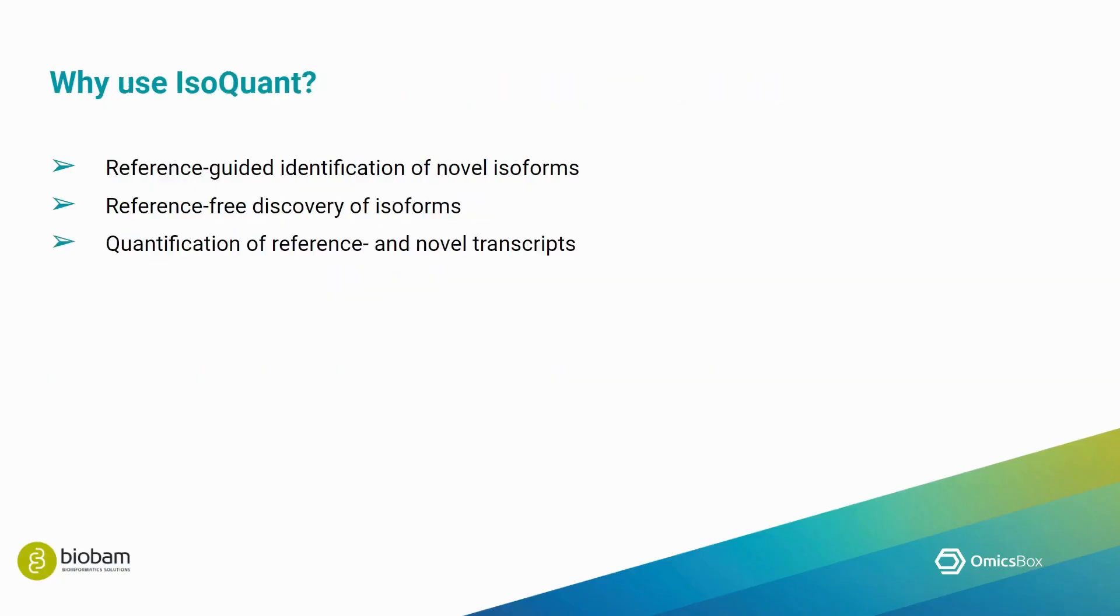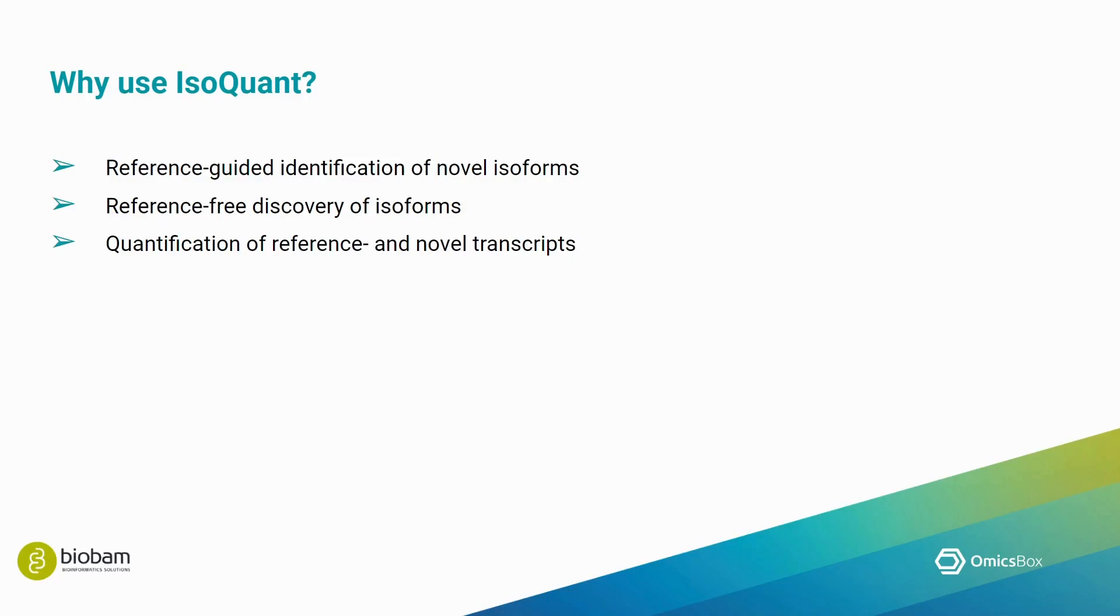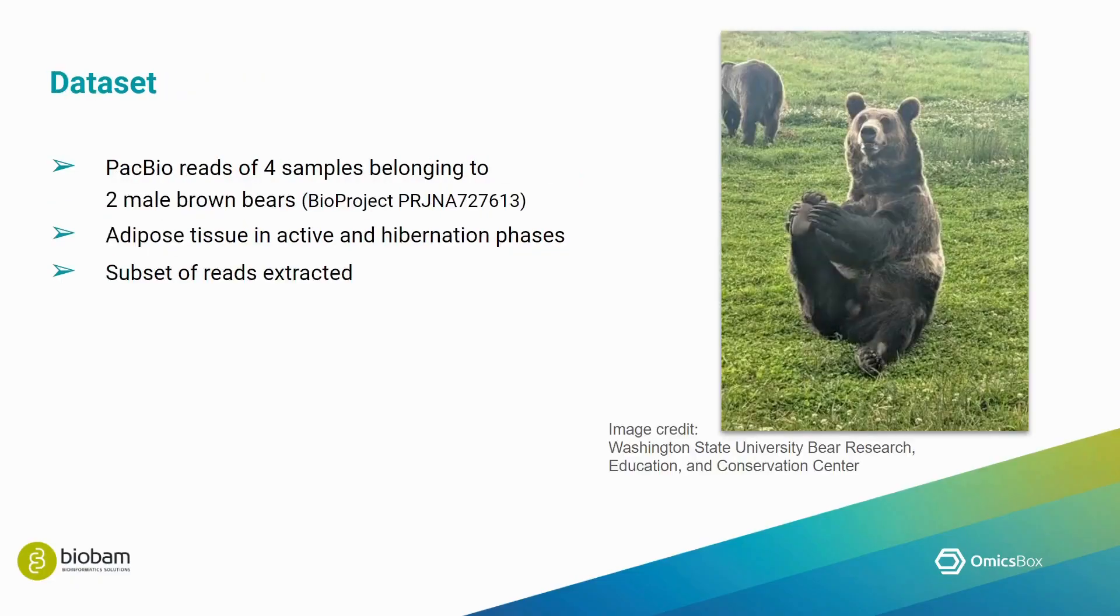Now, why would you want to choose IsoQuant? Well, one of the reasons may be because it can be used to achieve different tasks. In this demonstration, we will use IsoQuant in OmicsBox in three different ways. Firstly, we will perform a reference-guided identification of novel isoforms. Secondly, we will use IsoQuant's discovery mode to perform reference-free discovery of isoforms. And thirdly, we will perform quantification of reference as well as novel isoforms.